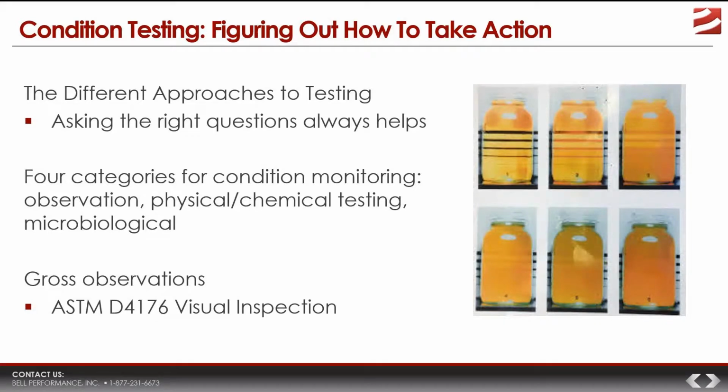And from a fuel microbiology standpoint, from a scientific standpoint, those questions have to be along the lines of, do I have microbial contamination above a certain level in my storage tank? How much microbial presence do I have in the tank? And then third one, is the presence that I do have, is that contributing to some existing problems that I may know about? Or, if not, how likely is it to do so in the near future?